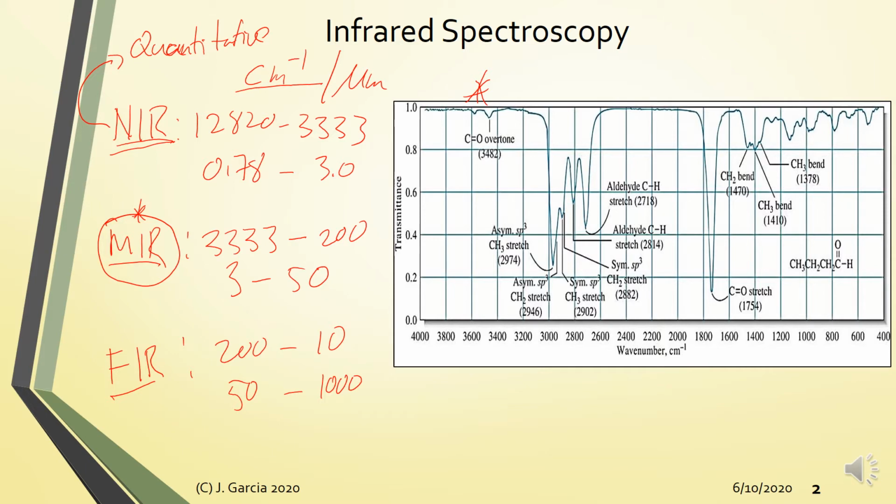Traditionally, you would do separate analyses for each component. For protein, you do Kjeldahl. For carbohydrates, maybe some Brix analysis or HPLC. For fat analysis, you do exhaustive extraction using Soxhlet, and then you weigh the recovered fats. These are very tedious procedures.